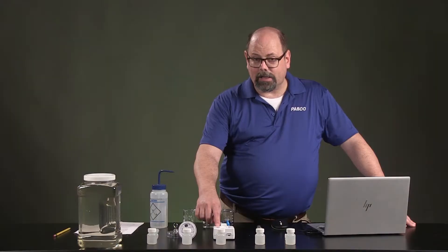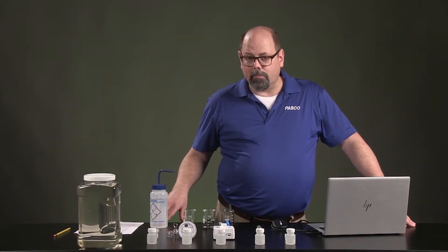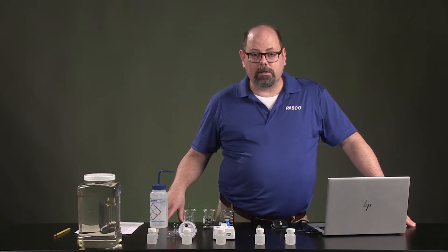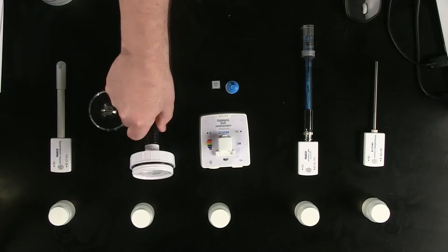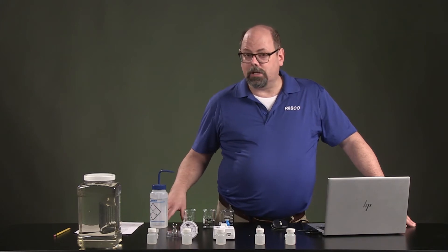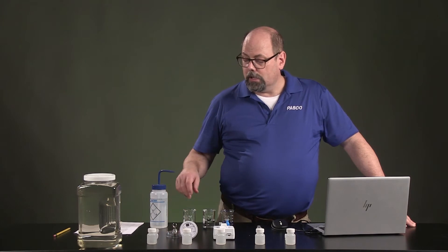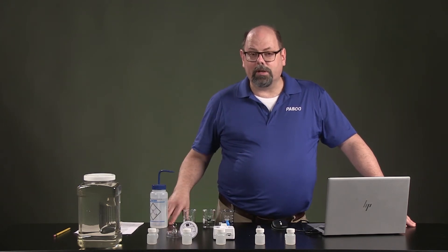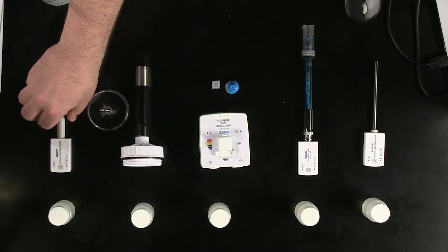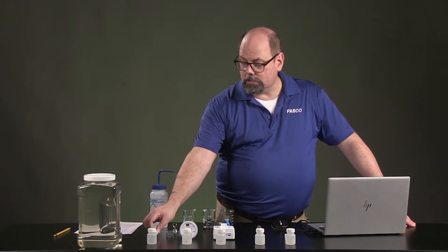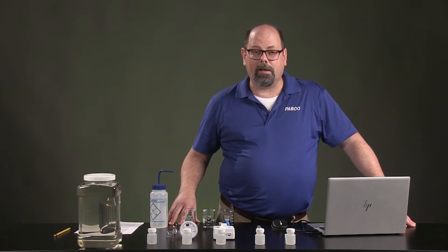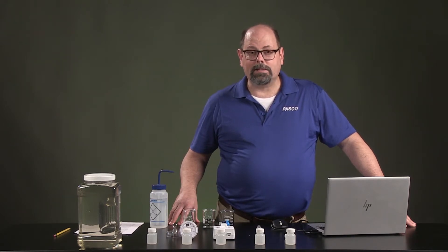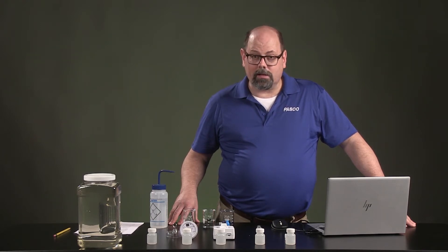Turbidity is going to be what we'll use next. The turbidity is how cloudy that solution is. The more cloudy it is, the more it's able to gather sun's energy, and it will stop the light from penetrating down to the bottom, maybe for plants that could grow and keep delivering oxygen. It will also warm up the water source. The next probe that we'll talk about is the dissolved oxygen probe. That amount of oxygen is like you and I need oxygen to breathe. The animals that live in the water can absorb oxygen through their gills. Typically, that ranges from 1 to 14. 6 and above is livable, and if you get below 6, it's going to start to cause fish to die. The final one is how conductive the solution is, and this is a conductivity sensor, and that's how much salt is dissolved. That'll govern osmotic processes that are in the water and make it healthy for the things that live there.